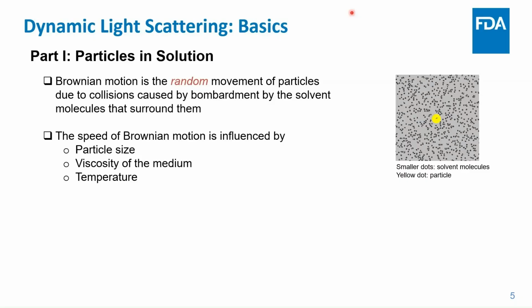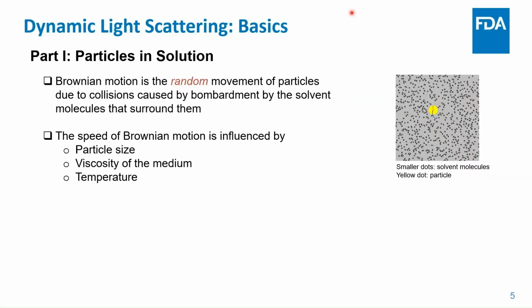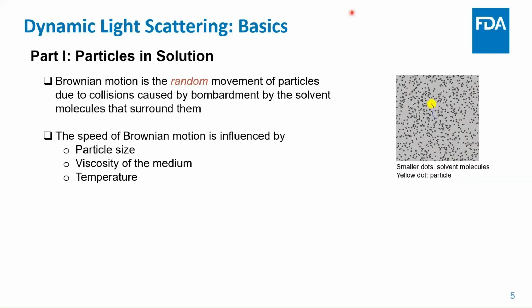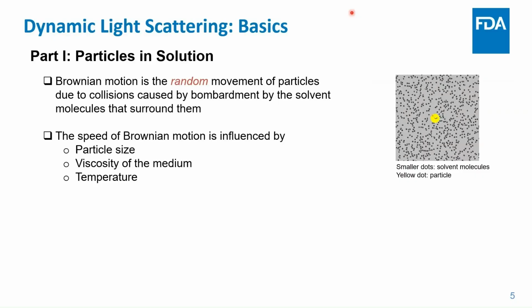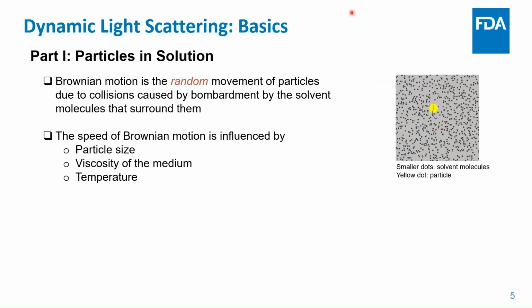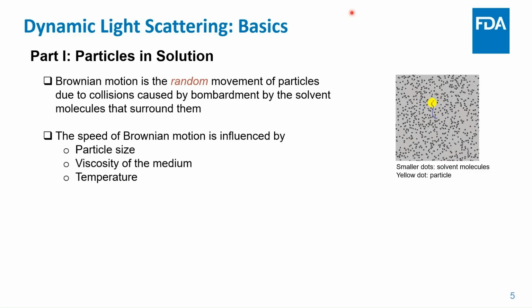The other thing is drag. In a solvent, the particle really isn't moving by itself. It has a solvation sphere, so it's hydrated by whatever the solvent is. In some cases it's water, but it can also be salts or other adsorbates from the system.